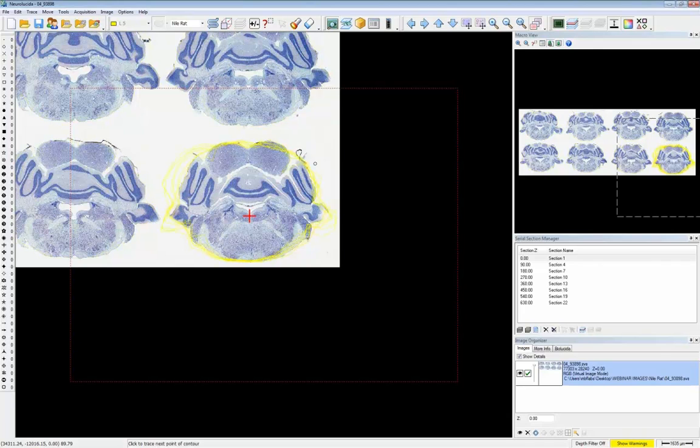Well, yeah. So now what you could do is you can continually add to these data files. As you're working with these data files, you can continue to trace additional regions of interest to build your model with more and more detail and more accuracy, and then keep it registered with the image data that's underneath that you're building this from. Save that data file, and then quickly register and align them, and save that as an aligned data file that you can use for visualization purposes.